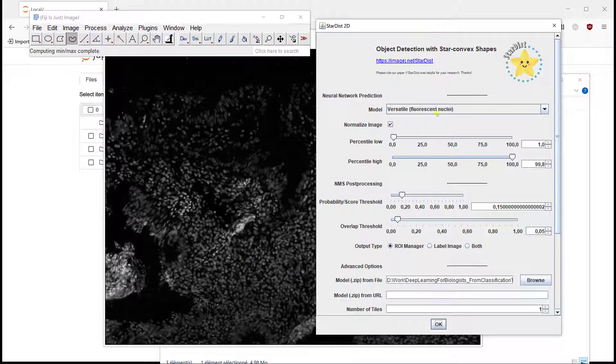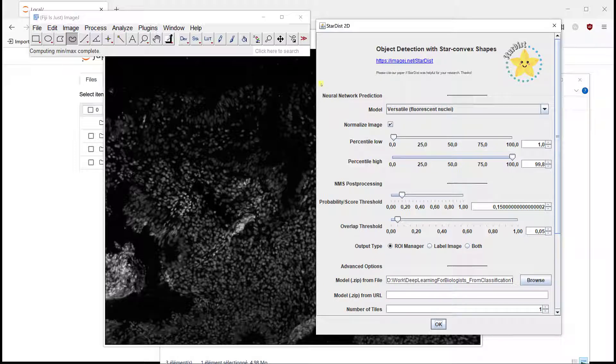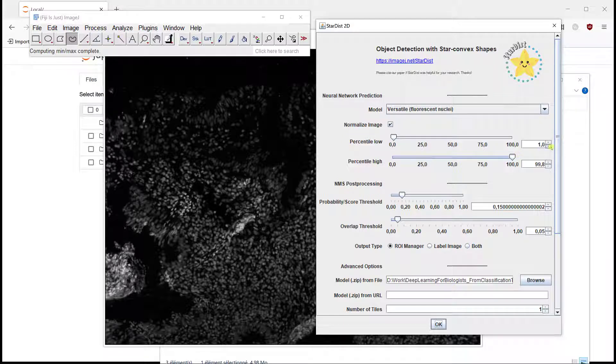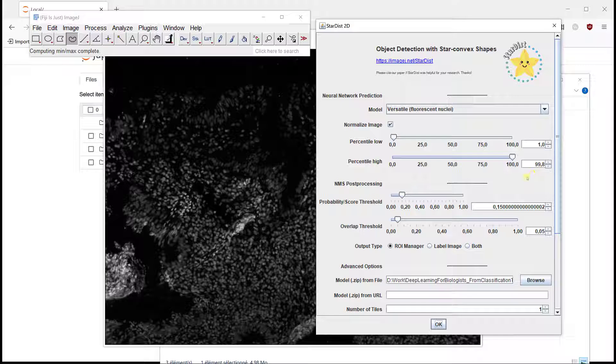You can use a versatile fluorescent model which is really good for fluorescence images. You shouldn't change the way it's normalized, and then you can change the overlap. I'm going to take a smooth overlapping threshold.